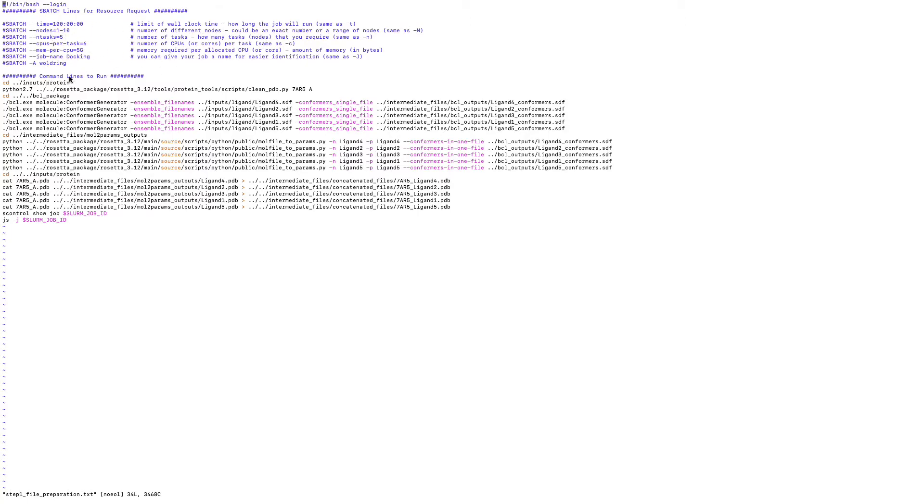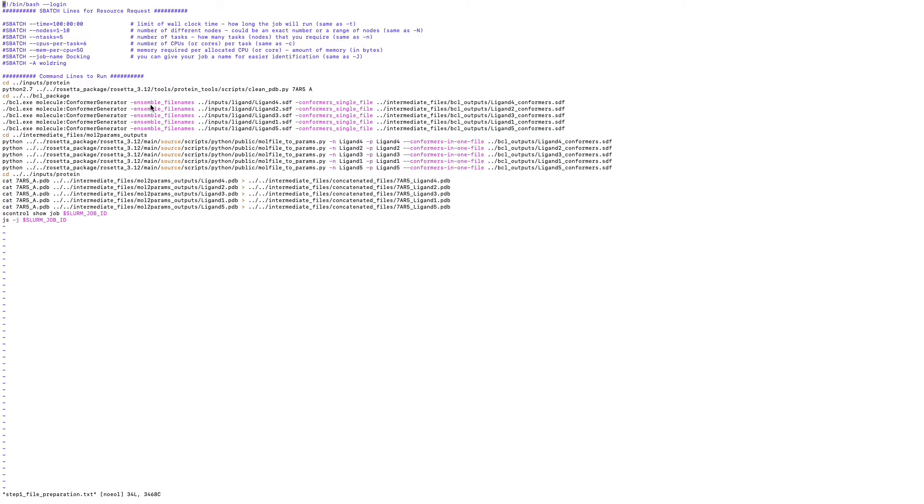Let's take a look. So, first, I'll go to protein. And download this protein structure, 7AR5 chain A. And then I'm going to run the conformer generator. Generates the conformers for this five ligands. And then I'm going to do the file conversion.